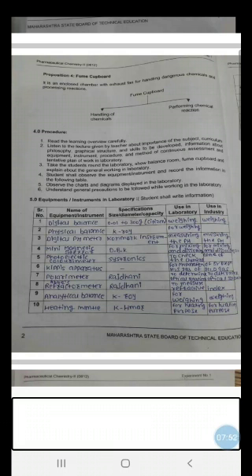Whenever you require long term heating, for carrying out any chemical reaction, sometimes you need to heat that flask or round bottom flask for say 4 or 5 hours at a particular temperature. Then you will be using these heating mantles. Apart from these there are a number of instruments like centrifuge machine, then your incubator, then for drying purpose we are using ovens, then Karl Fischer titrator, then a number of instruments are there in our laboratory. I am failing to recall the names immediately. So you have to select any 10 such instruments or equipments and note down the related observations in this table.